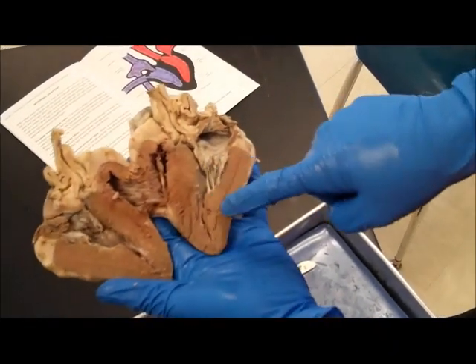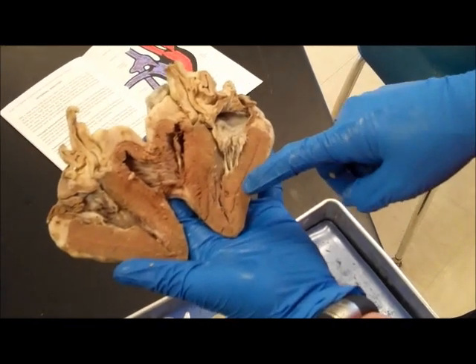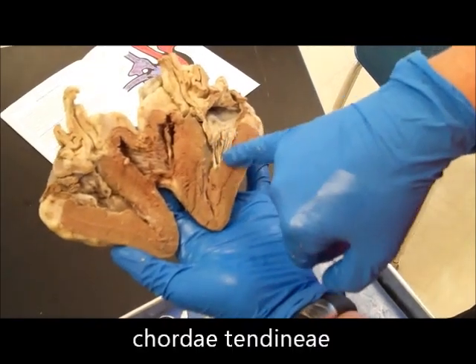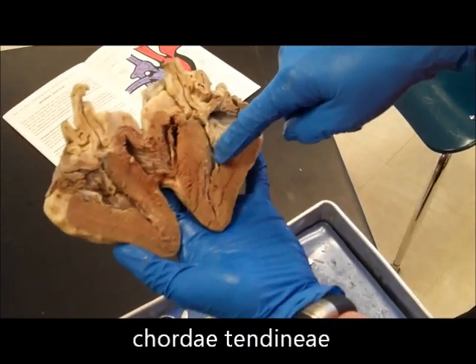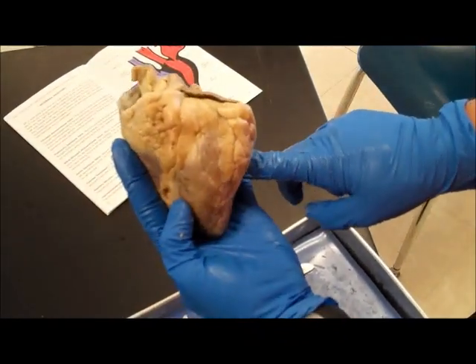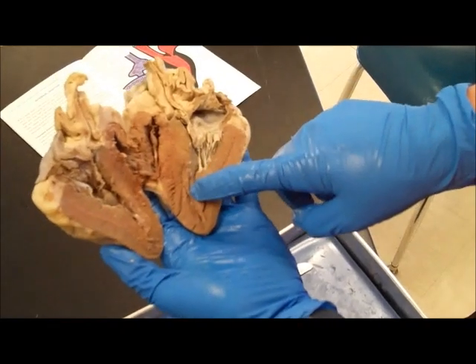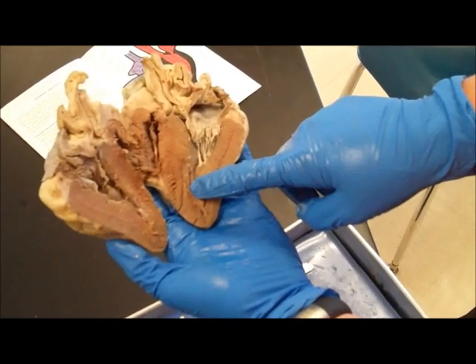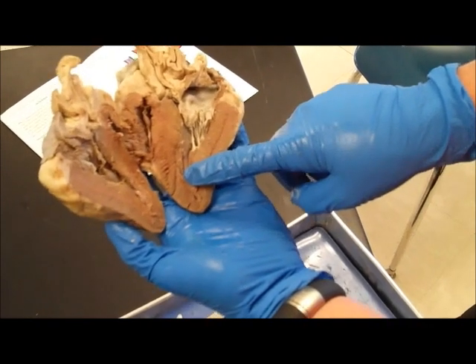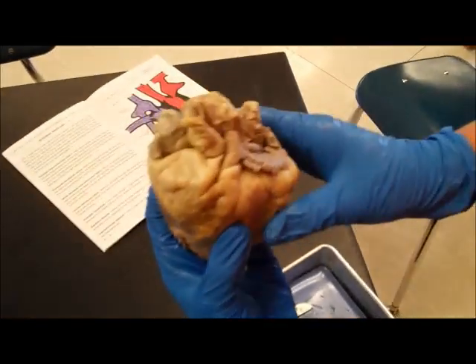Notice that the left ventricle is a much thicker-walled ventricle because it's pumping blood out to the whole body. Also notice these chordae tendineae, which look like little strings, what we call heartstrings. So again, when we close the heart up, we are on that left side in that left ventricle. The last part is the oxygenated blood from the left ventricle being pumped out through the aorta. So we can close up our heart here and look at the top.